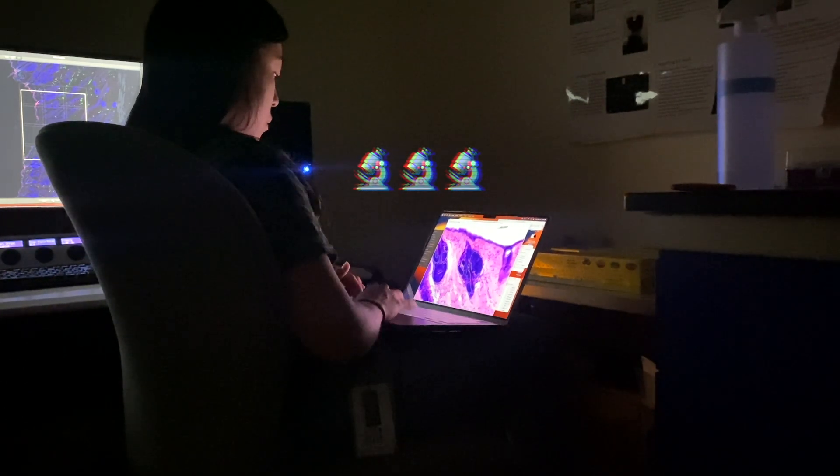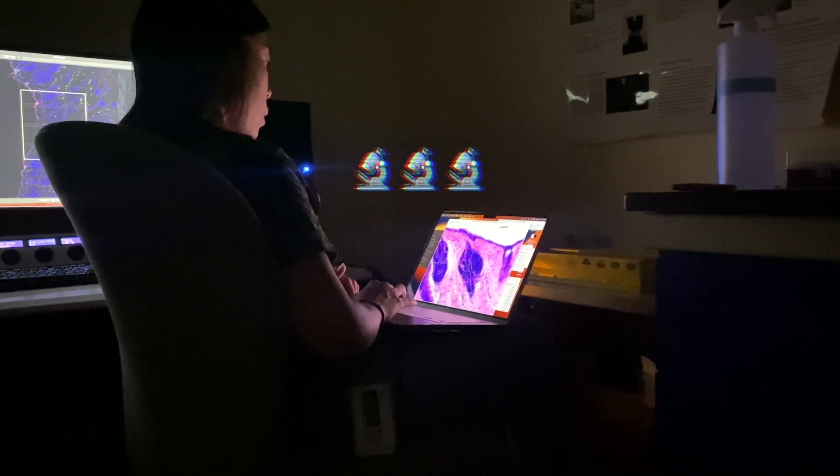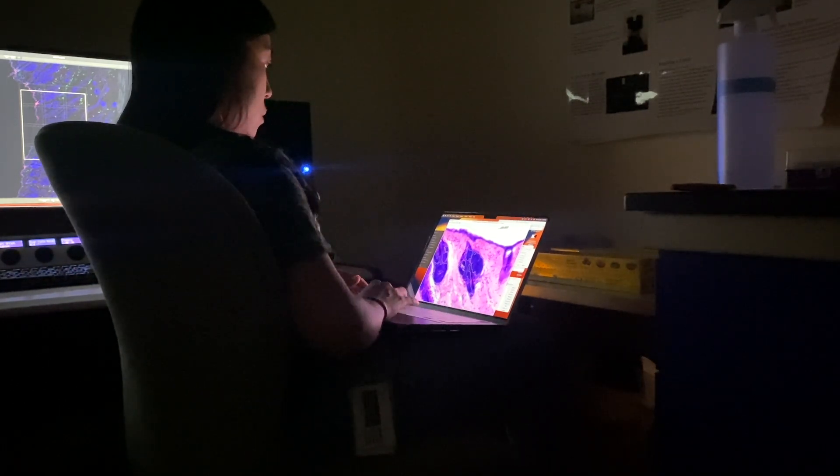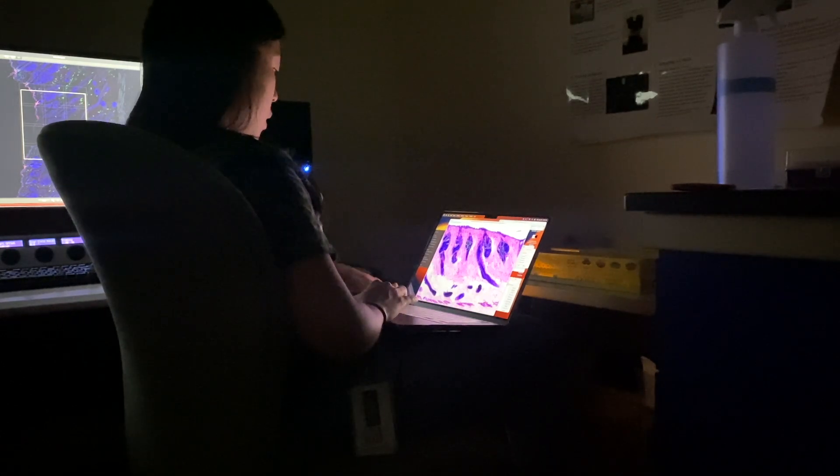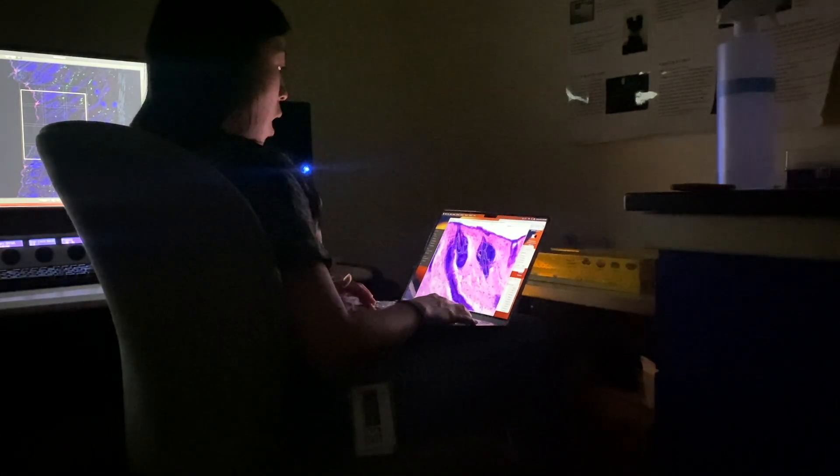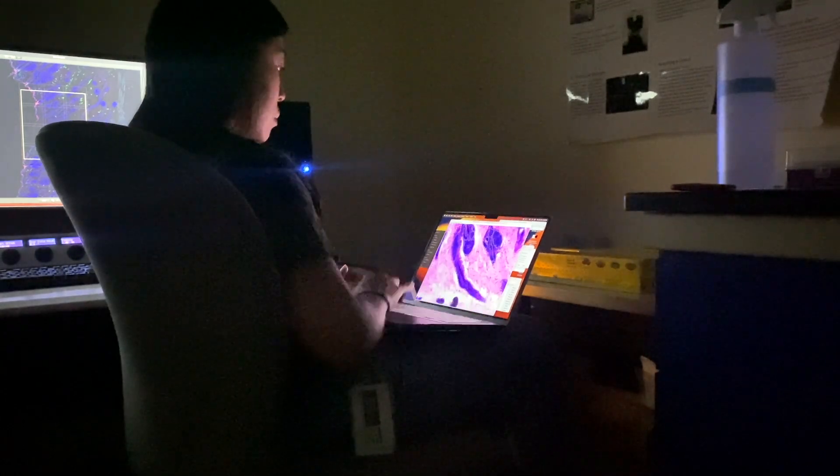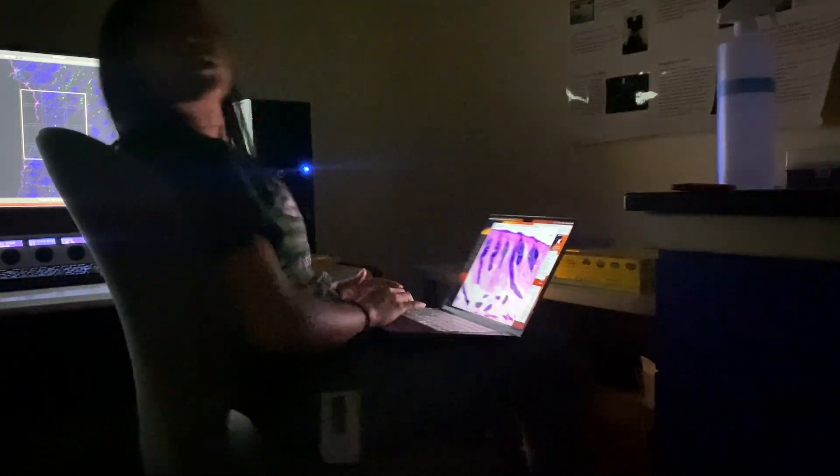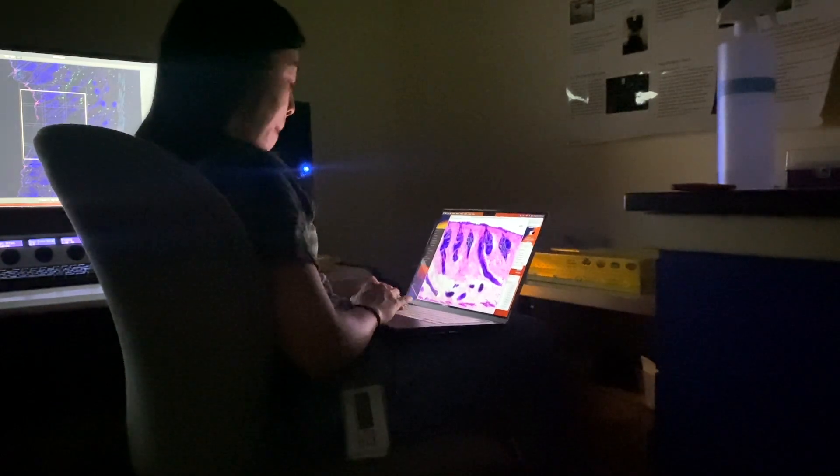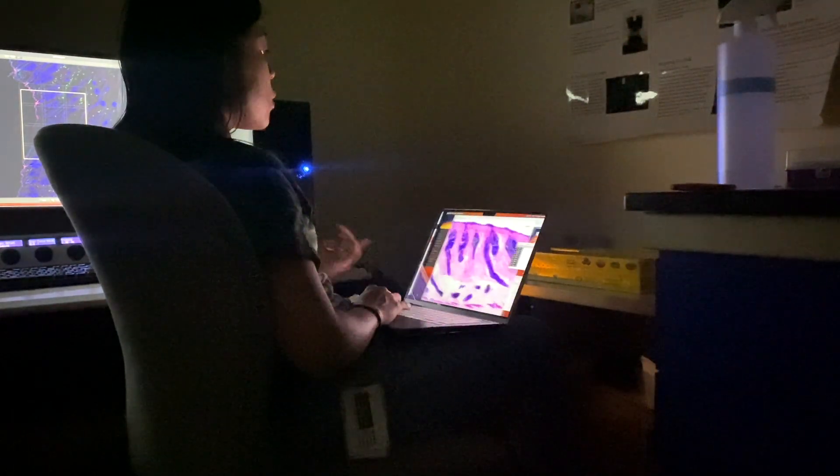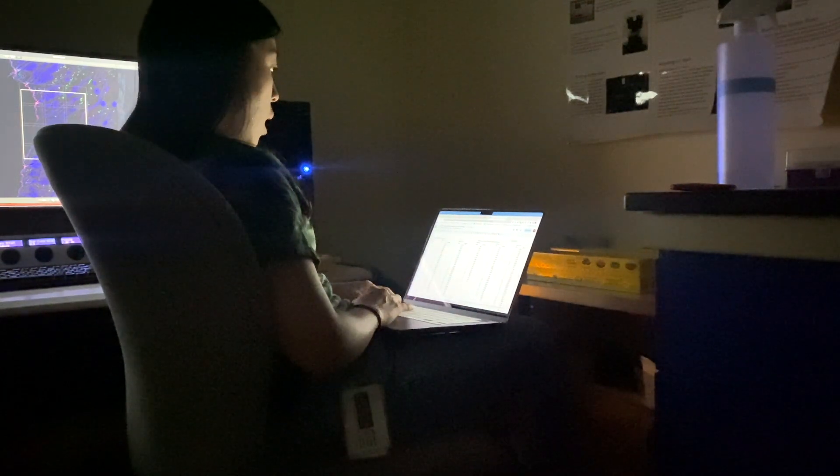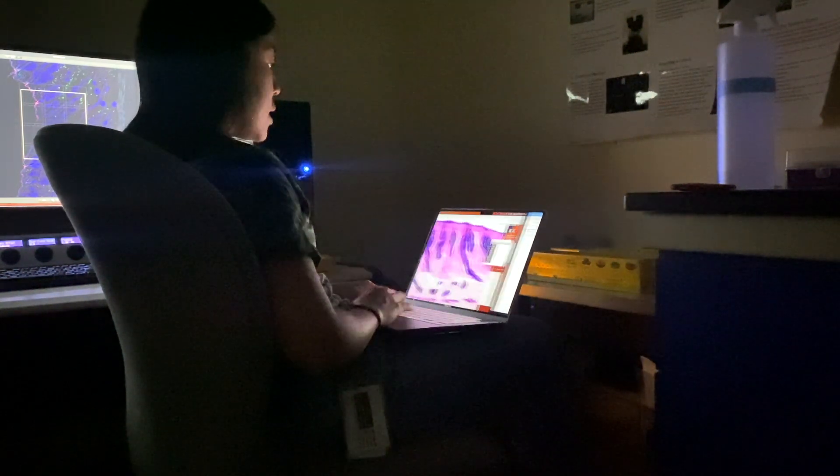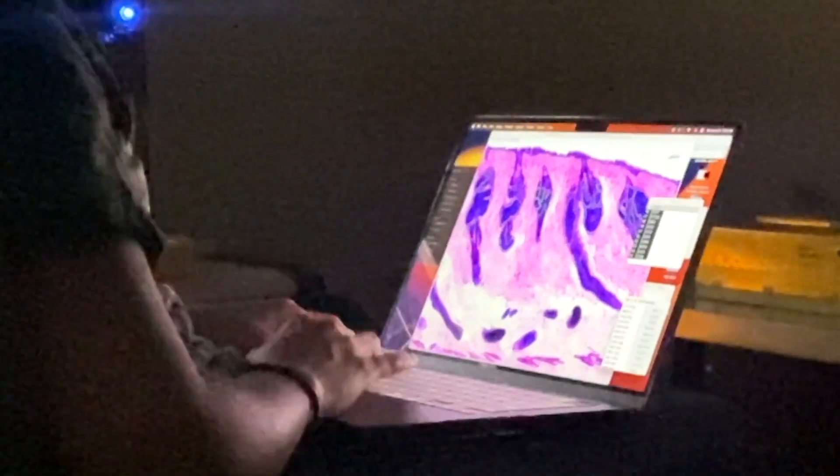We image with a light microscope, so nothing fancy, but just zooming in and lighting it up. It's much faster and cheaper to get a look at your tissue or cells. I don't want to study specific cell types here, and I don't need to see them at such a close level as in the confocal microscopy, but rather the overall tumors, which are made of many cells. And so I can use this as a quick way to see how big tumors are, and then I trace around them in the pictures to measure them.